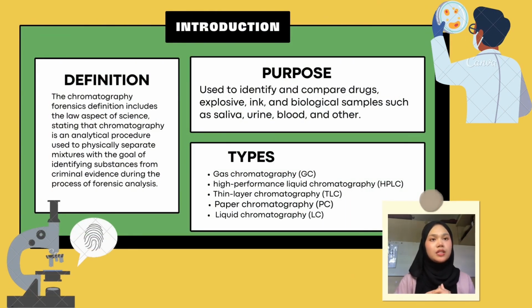Today we are going to present about chromatography in forensic science. First of all, the definition: the forensic definition of chromatography includes the law aspect of science, stating that chromatography is an analytical procedure used to physically separate mixtures with the goal of identifying substances from criminal evidence during the process of forensic analysis.